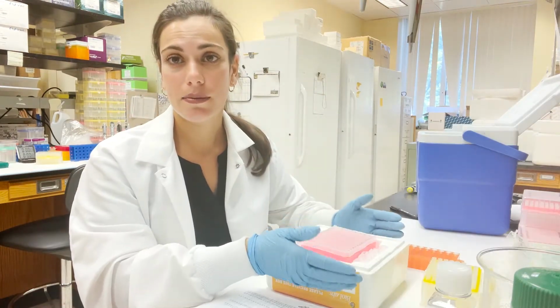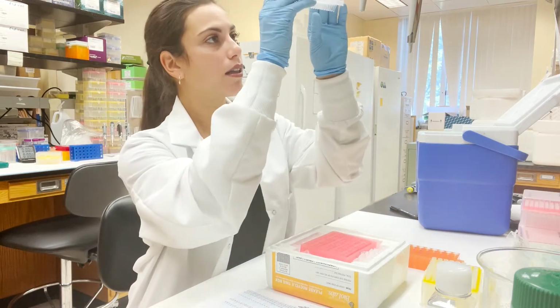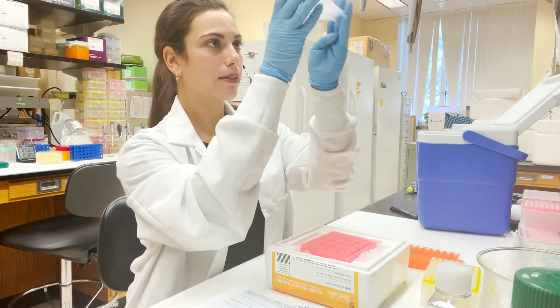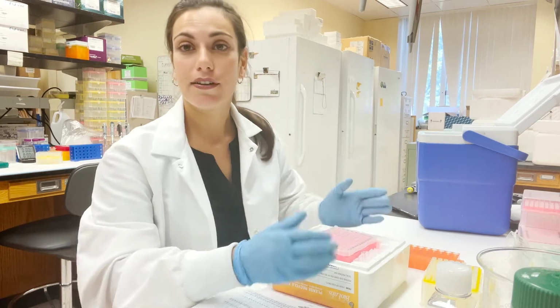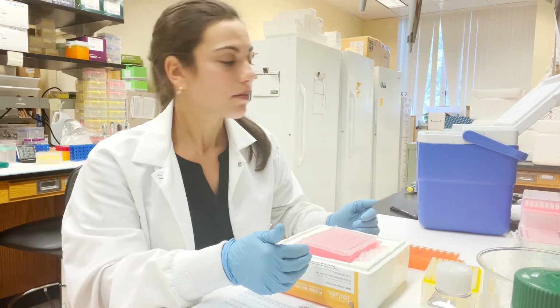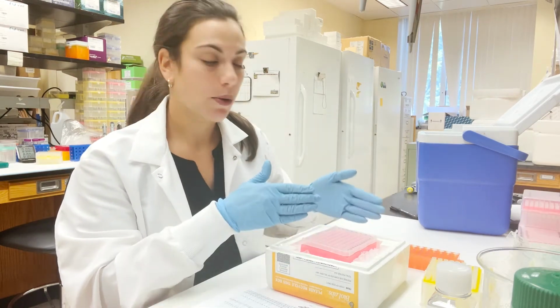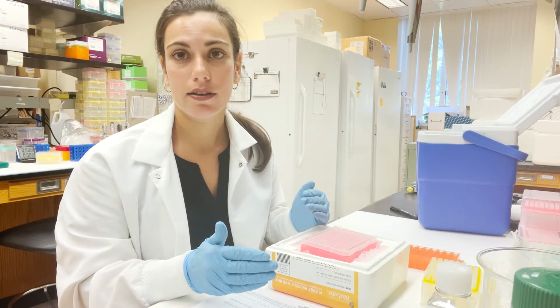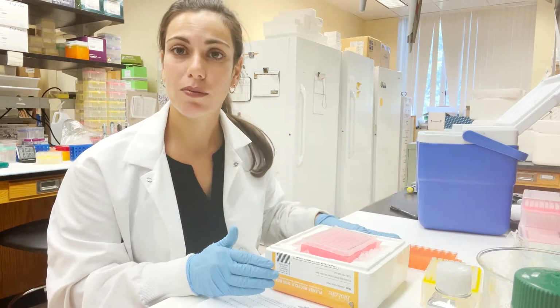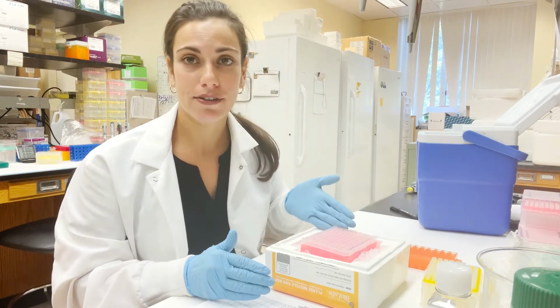So now I like to check to make sure that all of my pipetting looks good. I take a look at the bottom of the well, make sure that the amount looks correct. And if so, then I'm ready to go on to the next stage of adding in my DNA. Now, the DNA is a little more risky to add than the water because you don't want to risk cross-contaminating your samples. So I like to work one row at a time while keeping all of the rest of my DNA on ice. I also cap it after every row.